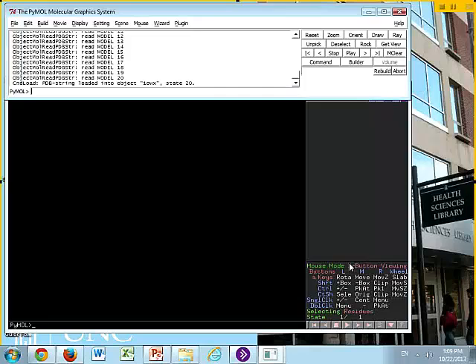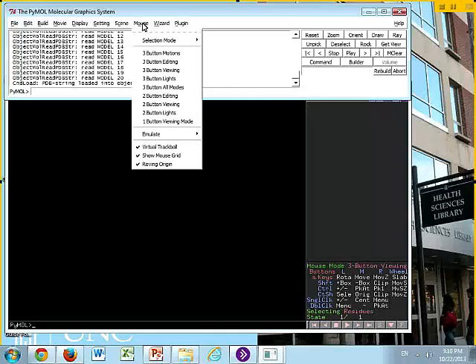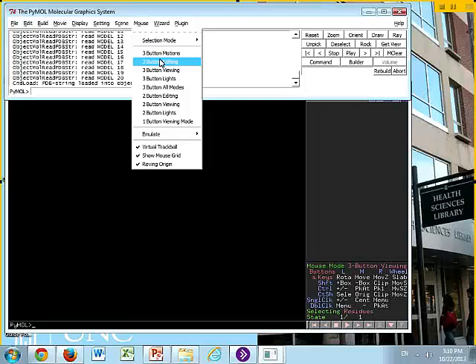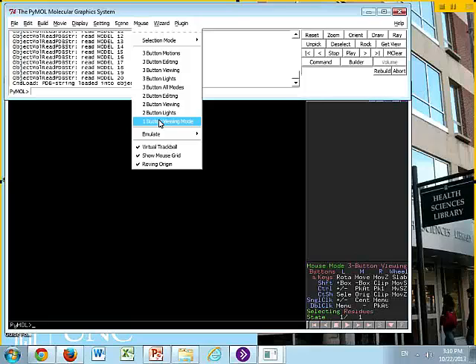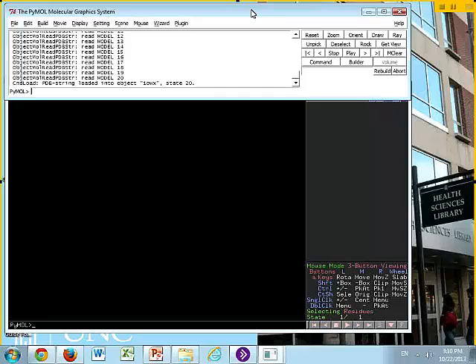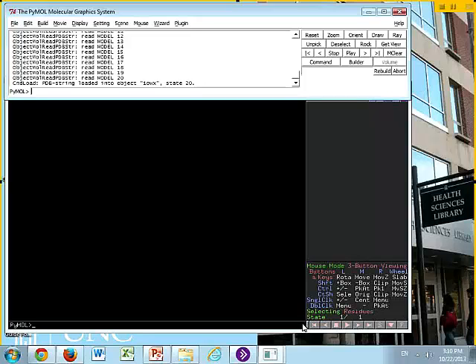Now, if you want to change, if you're home working on a laptop and you don't have a three-button mouse, then you can come up here to mouse, and you can pick three-button motions, editing, viewing, or two-button modes, or one-button viewing modes. So you can change. I find the easiest is to use a three-button mouse. I've done it so many years, it happens instinctively now, so we're going to stick with the three-button viewing. You have a lot more options. So those are your mouse controls.